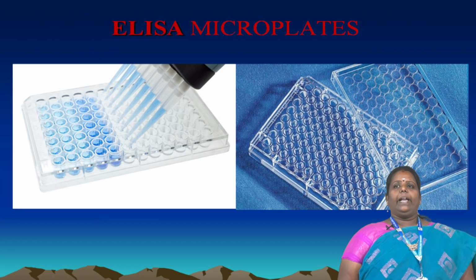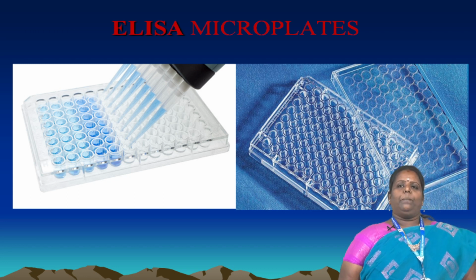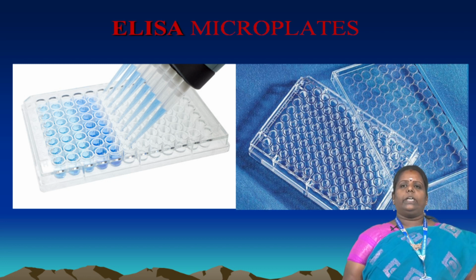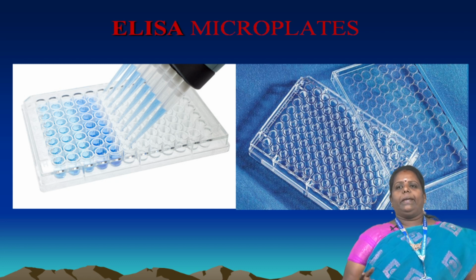This plate, the ELISA microplate, is also used for identifying proteins. The samples are coated in the wells of the plate. After identifying the techniques of the ELISA, the protein is also loaded.